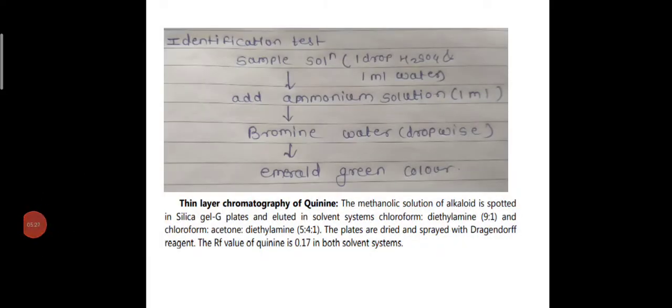After placing the sample spotted plate in the mobile phase, we spray the spraying reagent, that is Dragendorff's reagent, and after spraying we get the Rf value of the test and standard quinine sulfate samples, and the Rf value of the standard and test is compared.